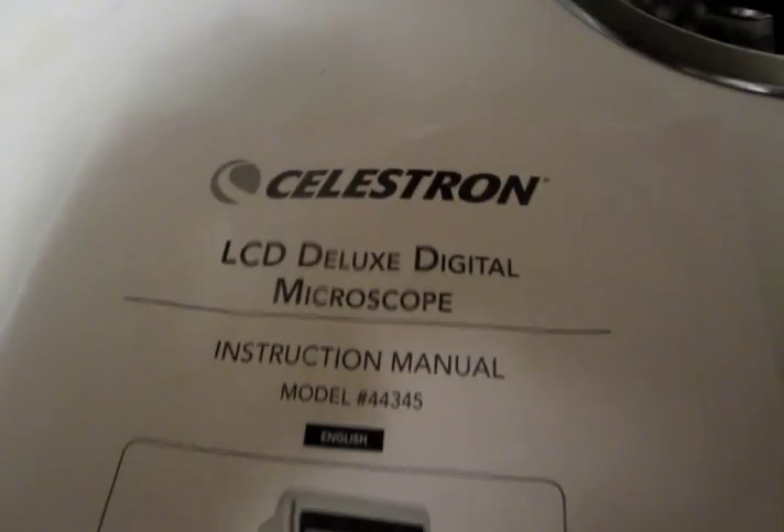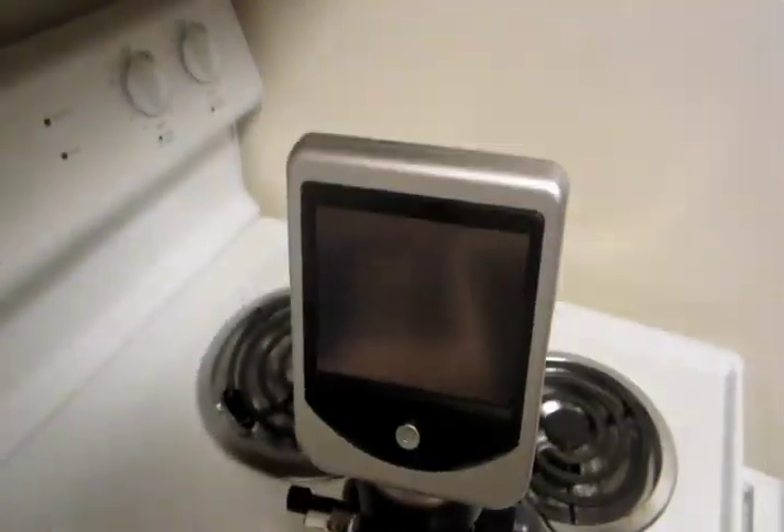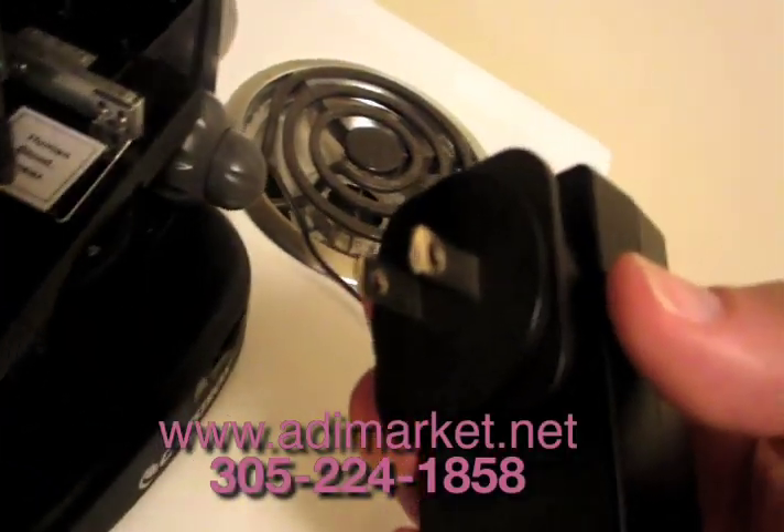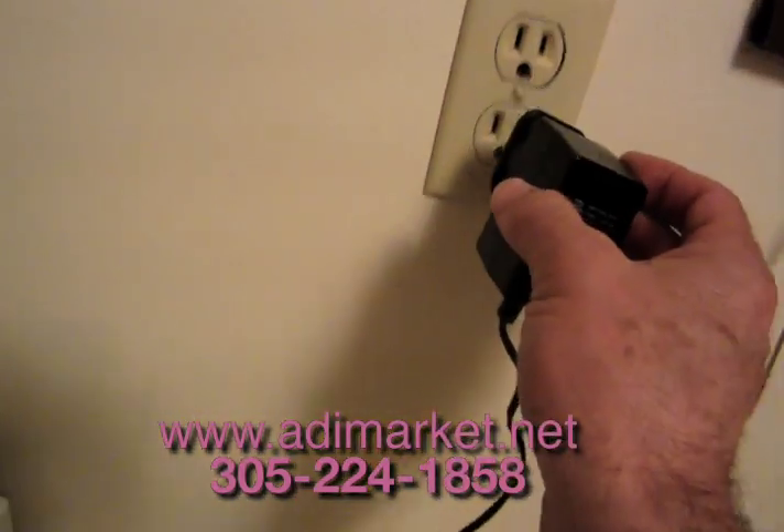This is a quick look at the Deluxe Digital Microscope. It's more for students or beginners, but it's a lot of fun with a digital viewer. Be sure you have the right AC plug — they come with universal plugs for different locations in the world.